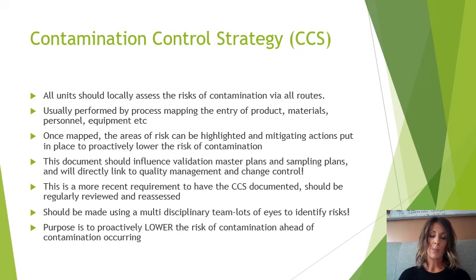It's usually performed by process mapping the entry of product, materials, personnel and equipment, etc. Once mapped, the areas of risk can be highlighted and mitigating actions put into place to proactively lower the risk of contamination. So what this CCS is for is to identify where you think contamination can come from and prevent it, reduce it, without having to have a failure to then work your way back.